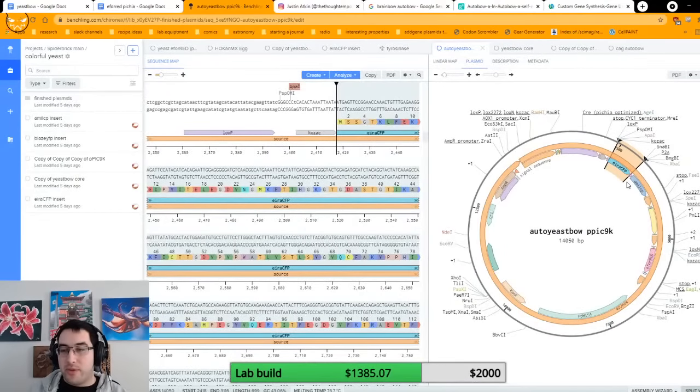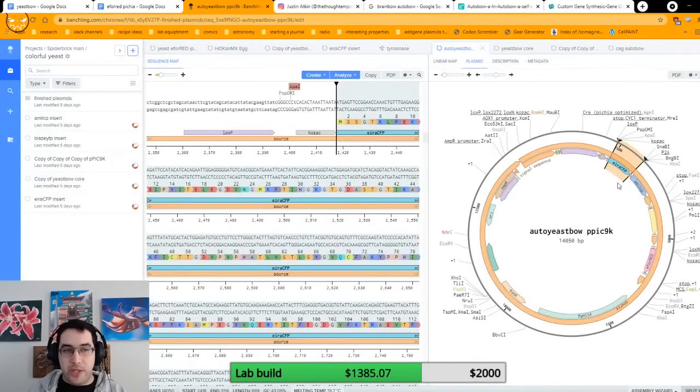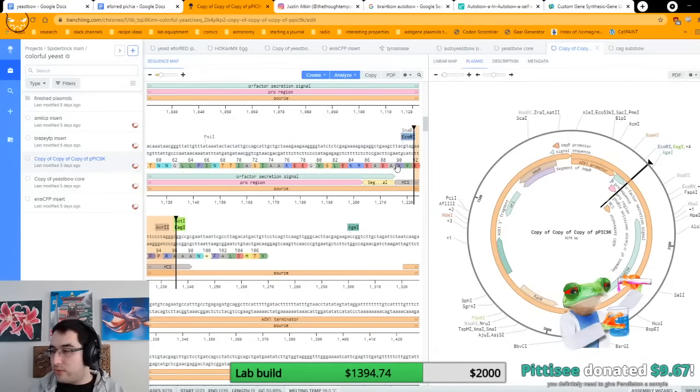Okay. Right. So what I was saying. Basically what I want them to do is take this plasmid and cut it 4 times. Not all at once, you wouldn't do this all in the same tube. I would want them to do this separately because it'd be impossible to separate out the pieces. But in order to get these pieces to fit into the backbone, which is this, as a reminder, I need every single one of those to fit in this hole. The problem with that is I had to use different restriction sites.